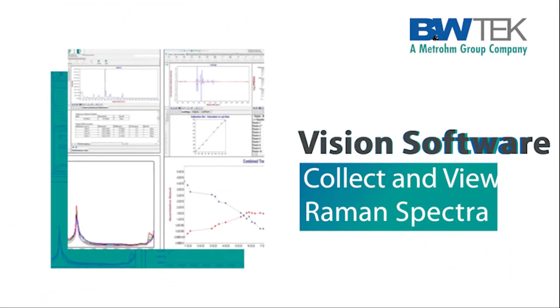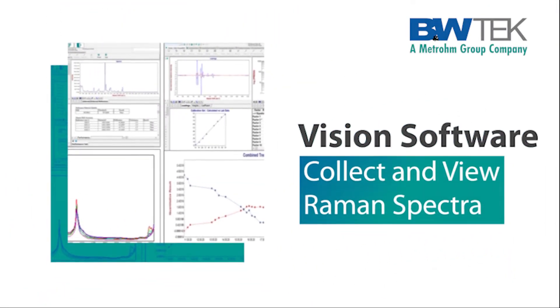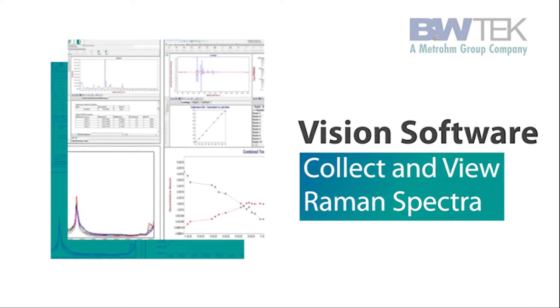Hi, I'd like to show you how to collect and view Raman spectra within the VISION software.